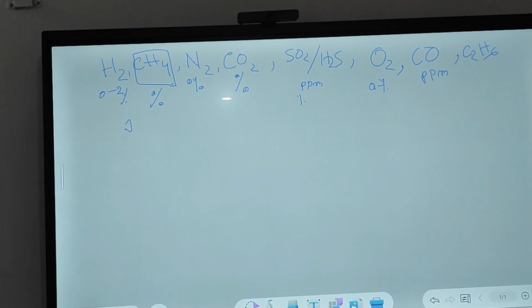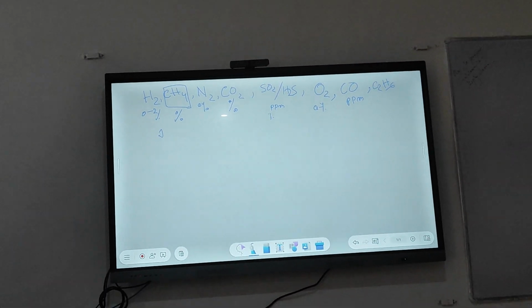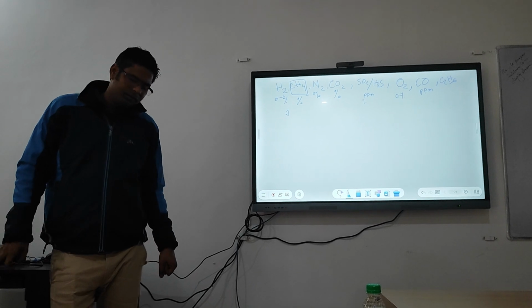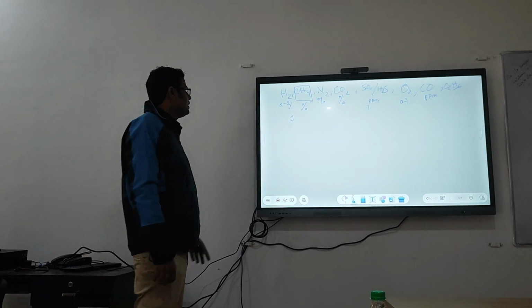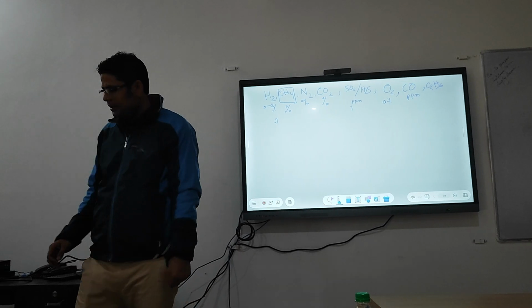If we want to analyze extended levels of biogas, many other gases can be added. Some higher hydrocarbons, ethylene, and sometimes acetylene are also there. They are very interested about them, but they are neglected. Mainly these gases are usually analyzed for biogas analysis.